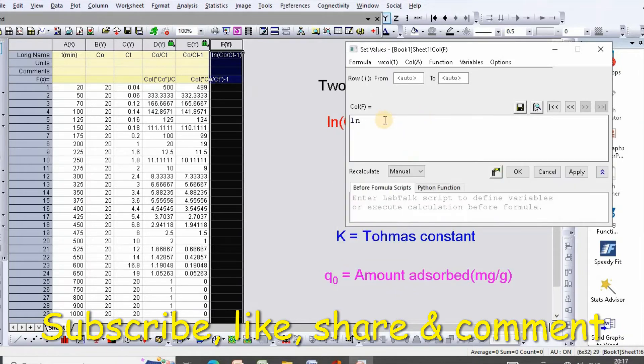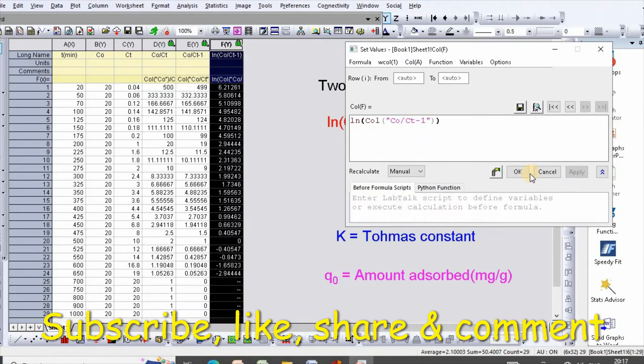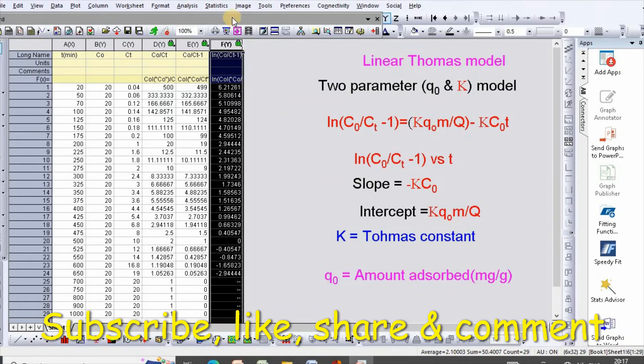ln, bracket close, then inside bracket column E, then apply, then update. Here is our value.